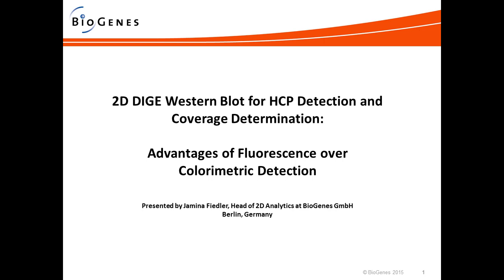Does each exposure during the image capture reduce the intensity of fluorescence? If I understood this question right, it's asking if it's obstructing the epitopes, or... I'm so sorry. I don't know.